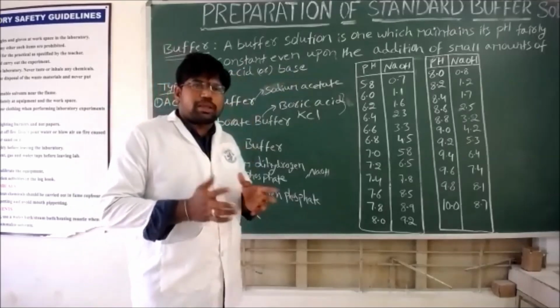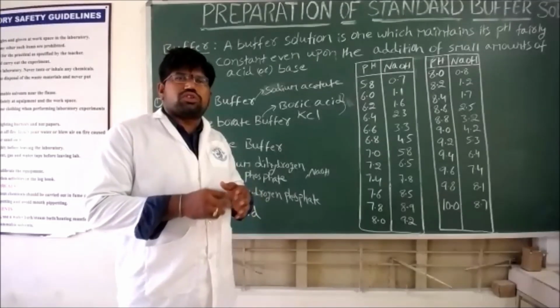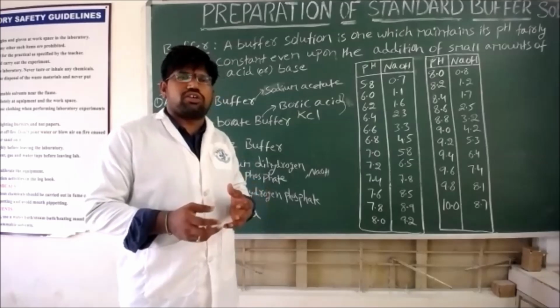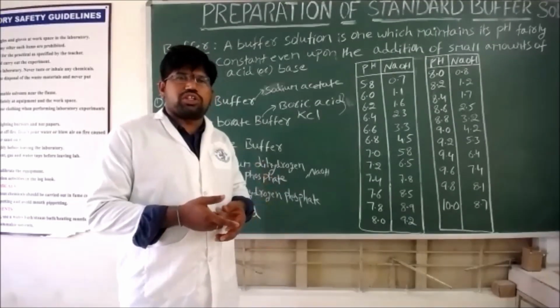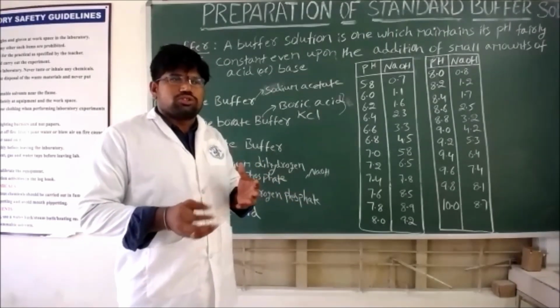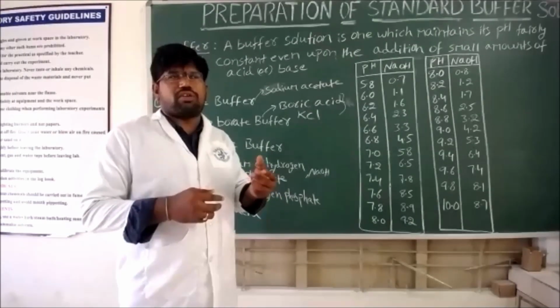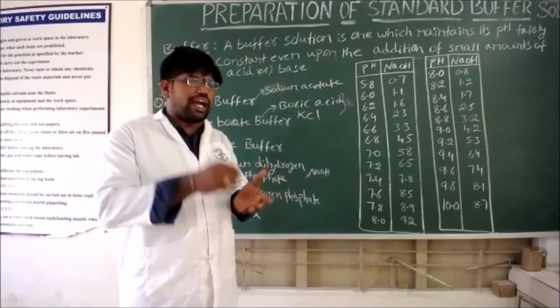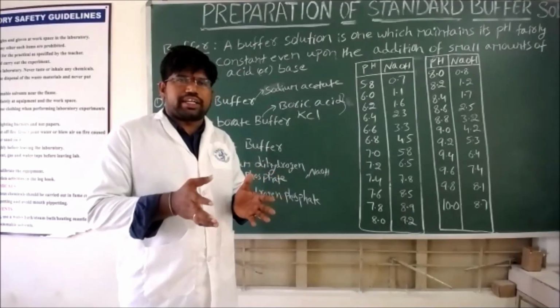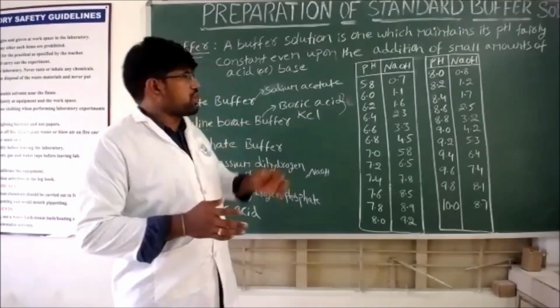In practical terms, in order to evaluate the dissociation or dissolution of a drug, or in biopharmaceutics to evaluate the kinetics of a drug, we will prepare the buffer in in vitro conditions, add the drug to it, and assess the drug kinetics, dissociation, dissolution, each and everything. So for that also we need a buffer.